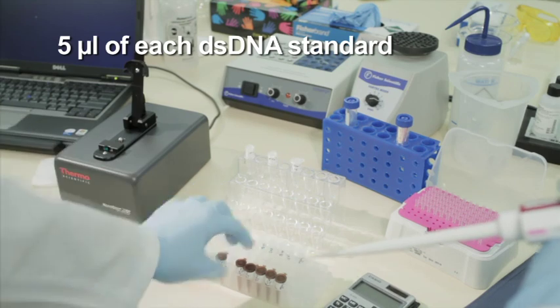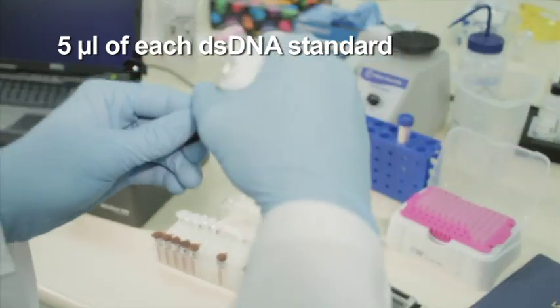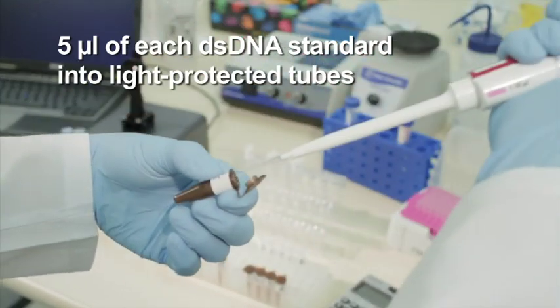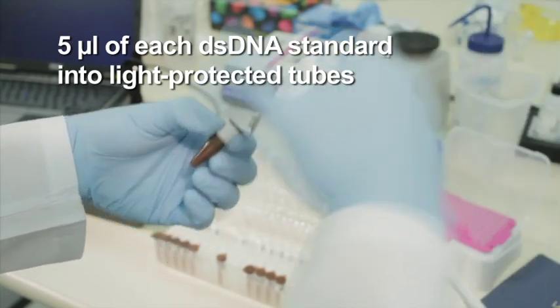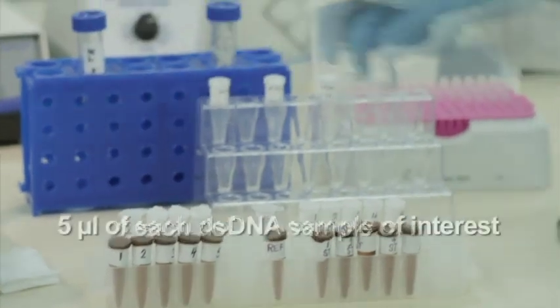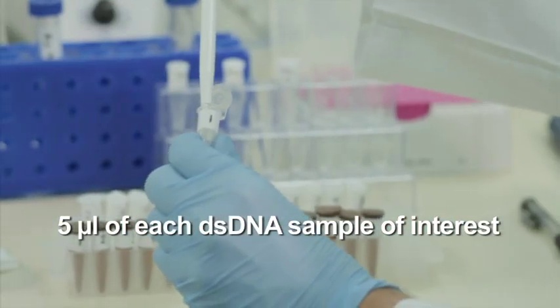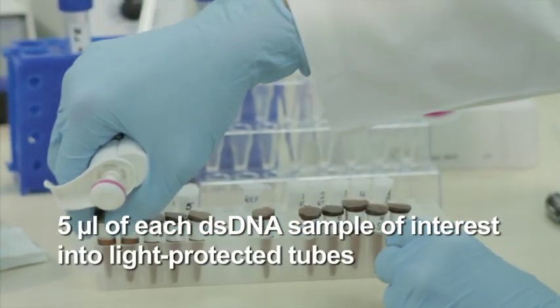Transfer 5 microliters of each of the diluted double-stranded DNA standards into an individually labeled nuclease-free amber or foil-covered tube. Then, aliquot 5 microliters of each double-stranded DNA sample of interest into the appropriately light-protected tube.